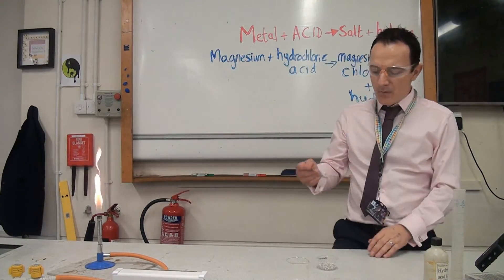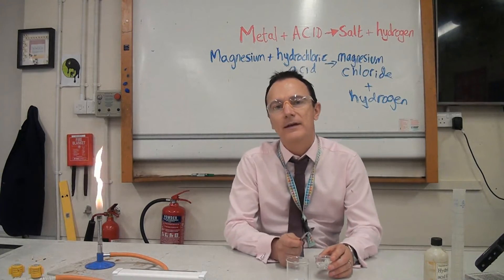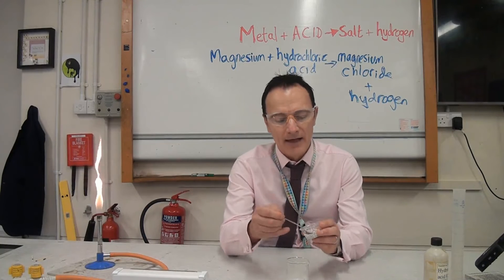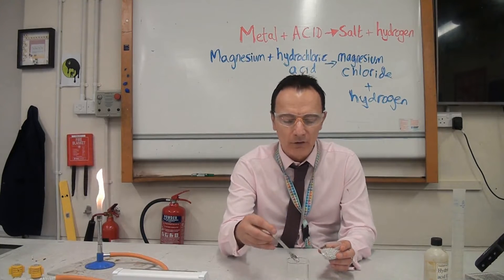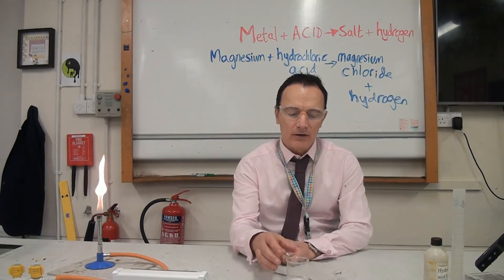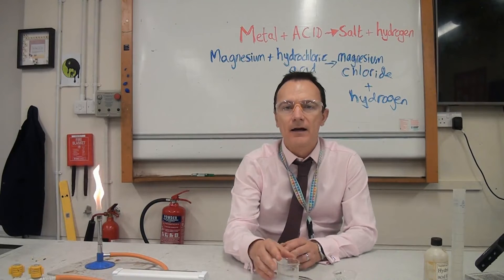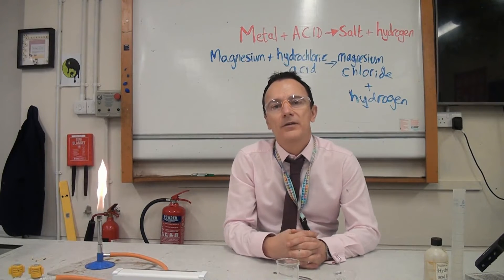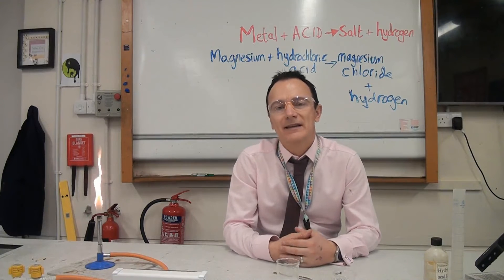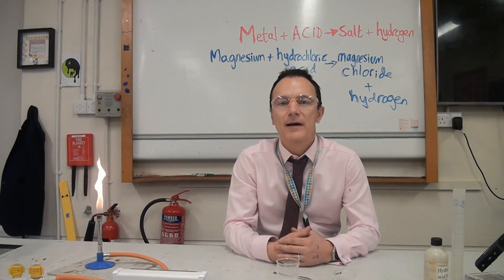So how much metal do I put in? We put in excess — that means we put in too much so that all of the acid reacts. I'm going to leave this fizzing away. When it's stopped bubbling we know all of the acid has been used up, and there should still be some magnesium left over because that would be the reactant in excess.